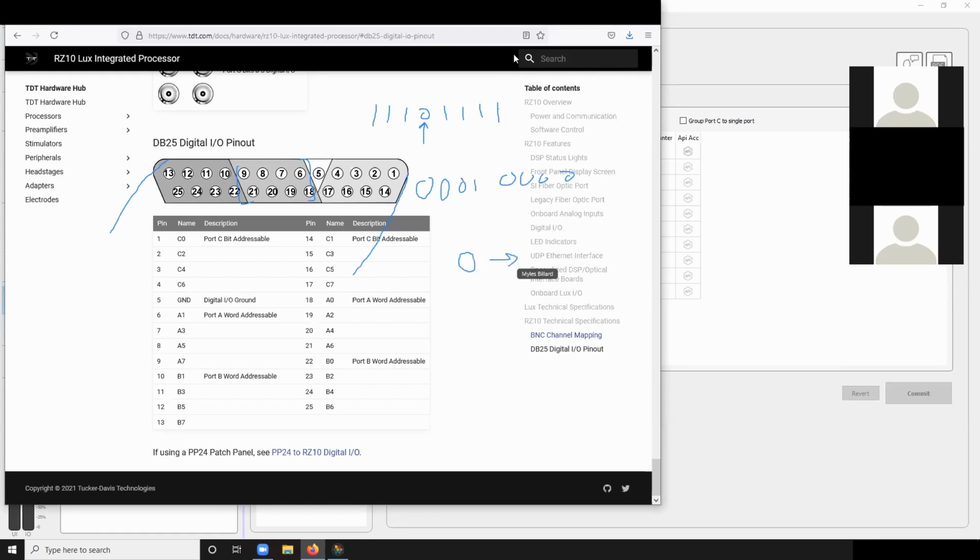And then when the lever press happened, this is 2 to the 0. So that's 1, 2, 4, 8, 16. You get a value of 16 coming through. So when that lever press happened, you get a 16. And then when it turned off, you get a 0. Does that make sense? Yep. It'll make a lot more sense too once it's contextualized. But in any case, that's sort of what the port A is doing.